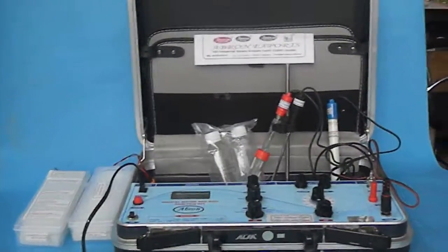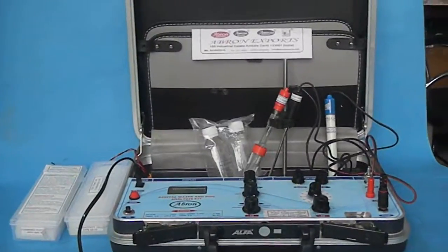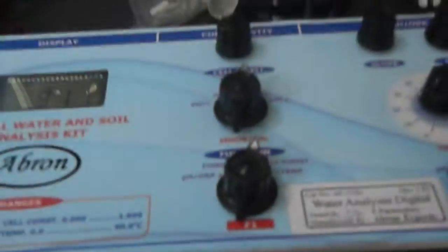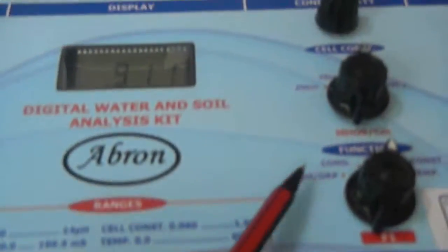This is the Water and Soil Analysis Kit by Abron Export. The kit has four parameters which is pH and ORP.